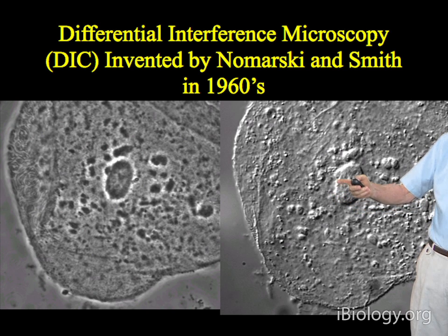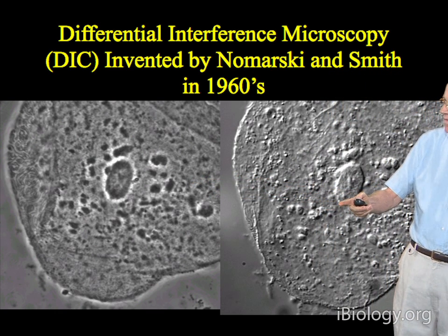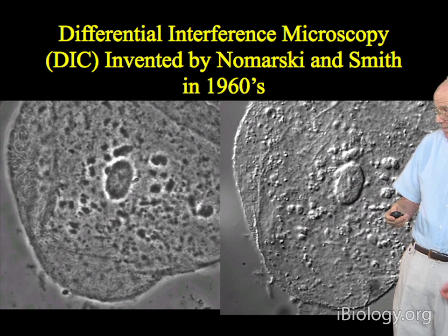And so here we can see the typical image for the same cell. This is a DIC image, and this is the phase image. And there are no halos at the edges. Edges are very sharply defined. And in fact, the thickness of the specimen gives the same contrast as the background, and therefore doesn't carry through as you do optical sectioning through the material.